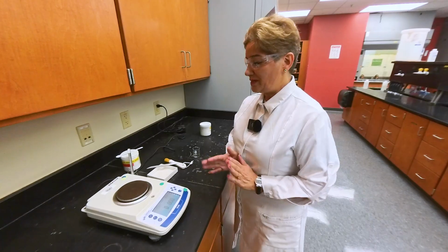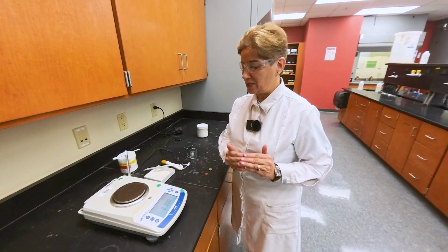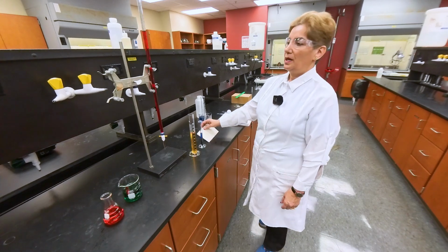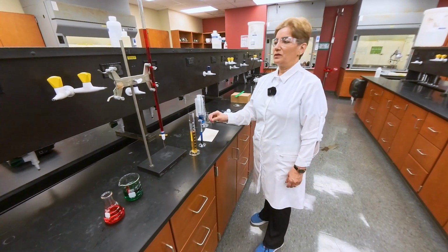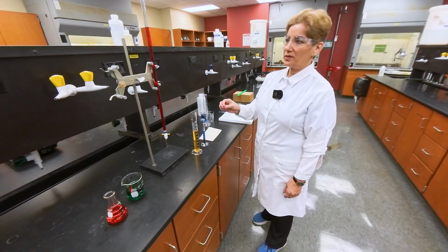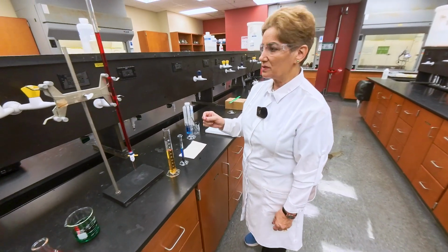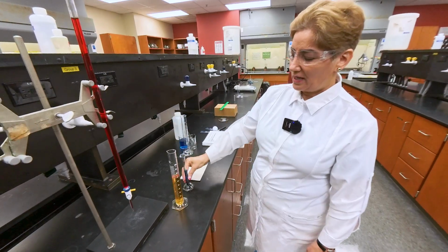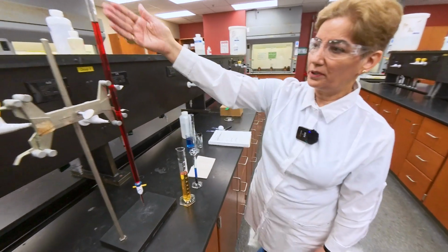Now we are done with measuring mass. We are going to move to measuring volume, the next part of the experiment. Okay. Part 2 of experiment 1, it's measuring volume. To measure volume, we have measuring devices used in the lab. One is graduated cylinders, and then we have a burette.